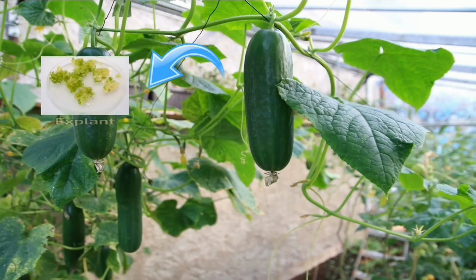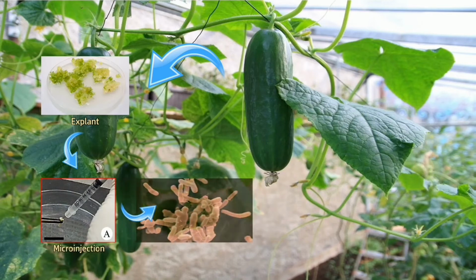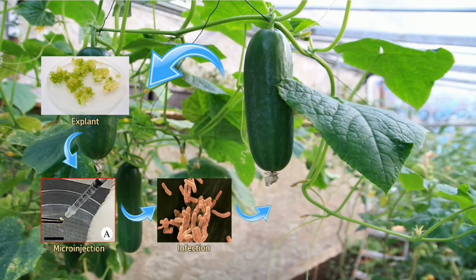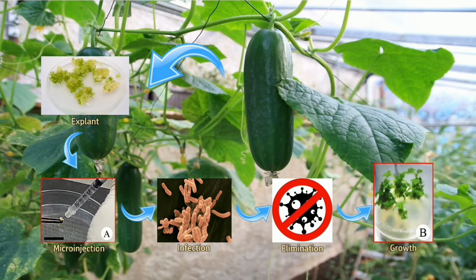As mentioned in the protocol and materials, optimization of culture media and conditions was done to test a suitable environment for microinjected shoot apical meristem of cucumber explants to be cultured in the actual experiment. Optimization relies on the type of antibiotic, explant, cultivar used, and concentration of the reagents.